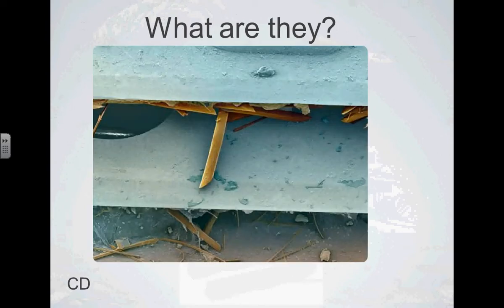It seems like it's really zoomed out. It's not. Morgan? Is it like a razor? Yeah. These are the blades of a razor, and these are little hairs that just got shaved off of somebody. Oh, yeah. Little flakes of skin. I thought that was like shells. No? It's magnified. Yeah, I thought it was the side of the street.